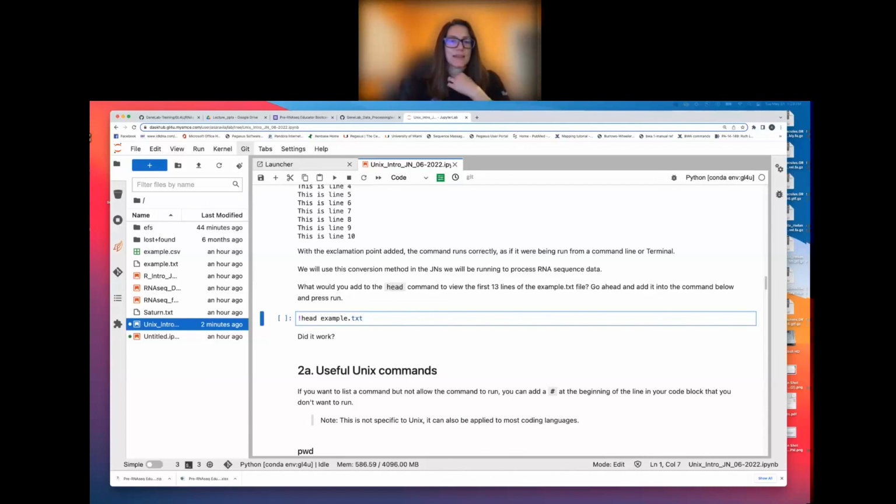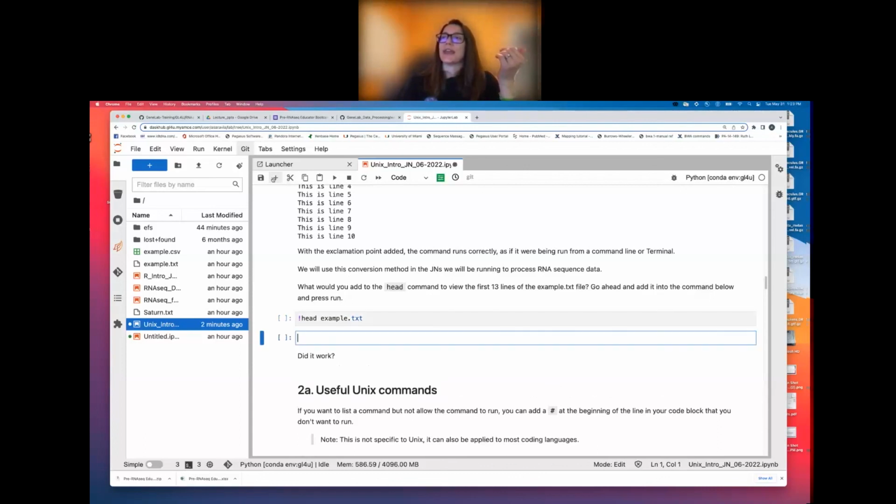So I see a lot of right answers, some I don't know. Okay, so just going up again, if you're ever unsure, I'll show you guys some things. So we can add a cell block. As Lauren mentioned, if you press the plus button at the top of your Jupyter Notebook in the toolbar here, you can add a block, and the default is to be a code block. Similar to what we did on the terminal, if you're not sure which option you need to tell it how many lines, you can add a code block. You guys can all go ahead and do that with me.